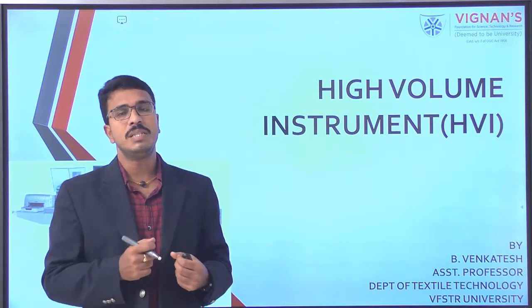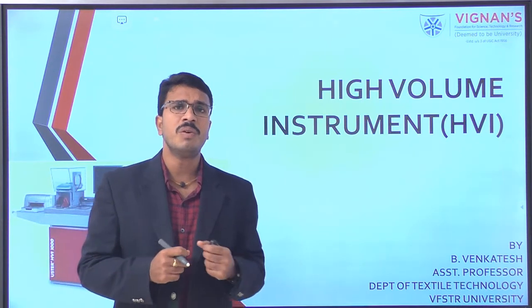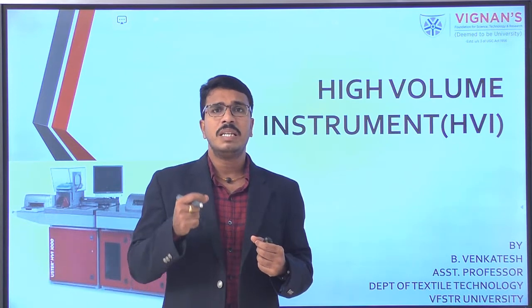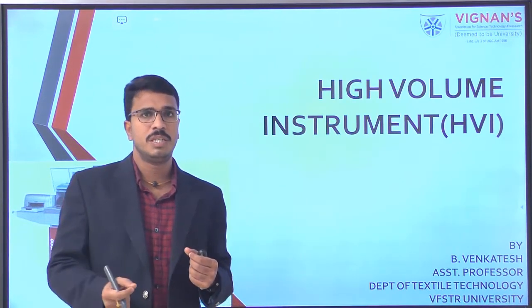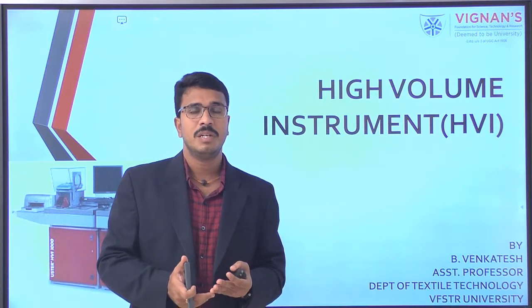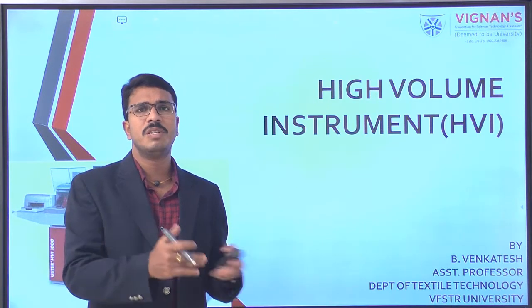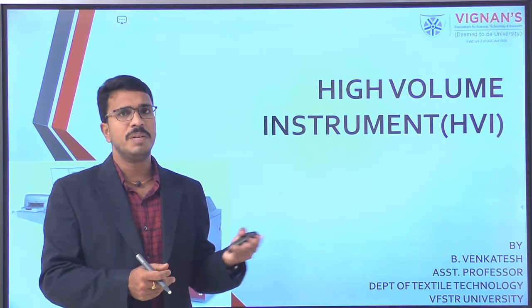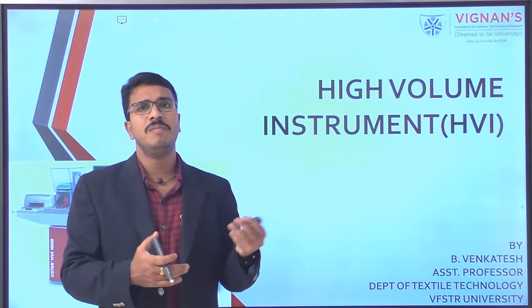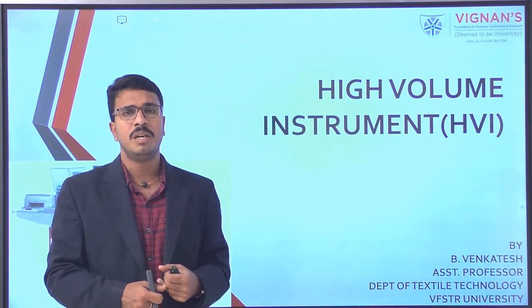Today's class we are going to discuss the latest developments in tensile strength testing, that is, the latest developments in the testing equipment. It is not especially related to fiber strength alone.